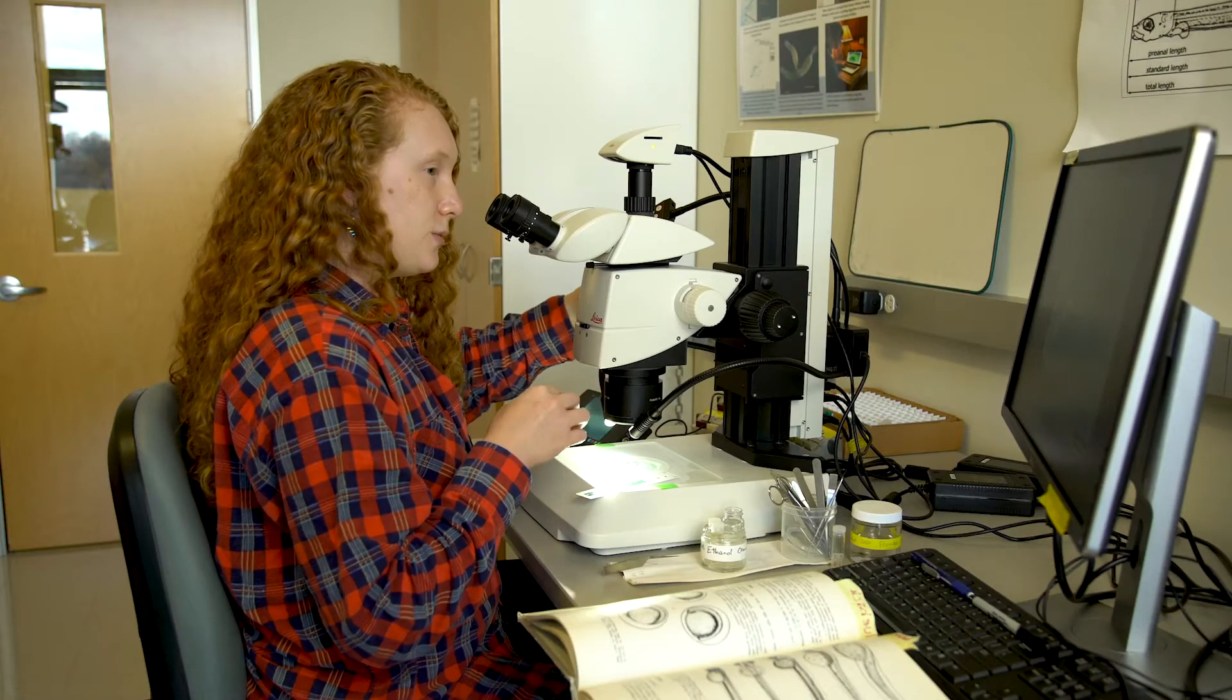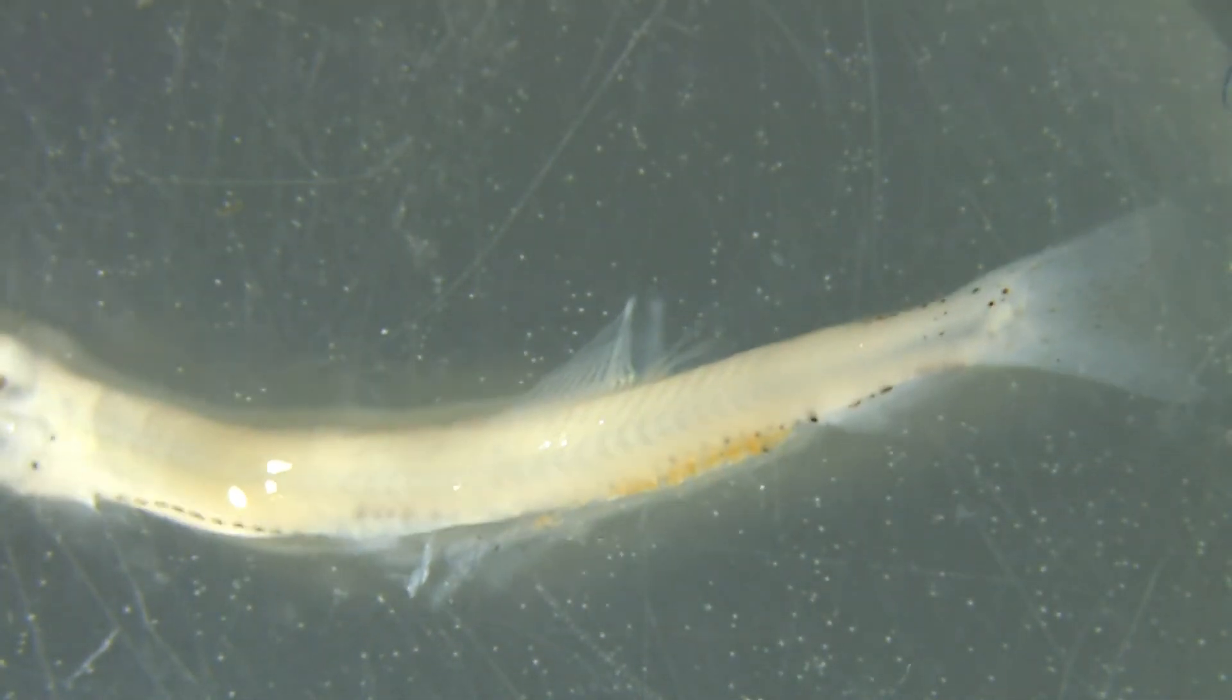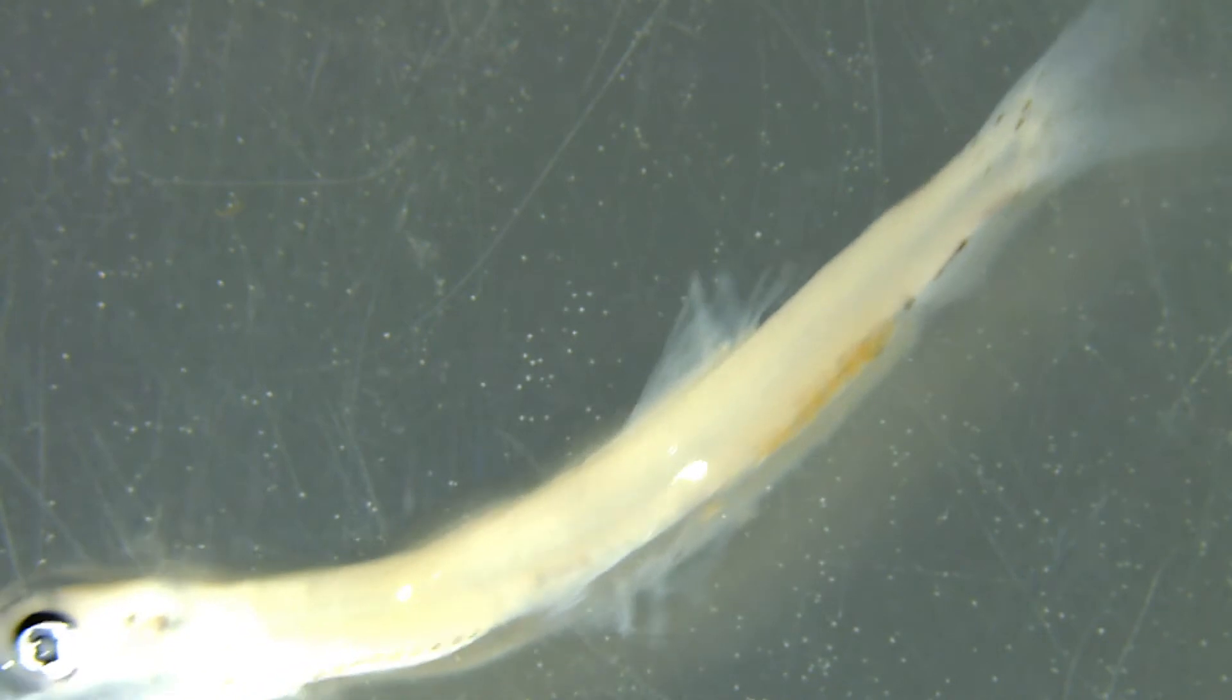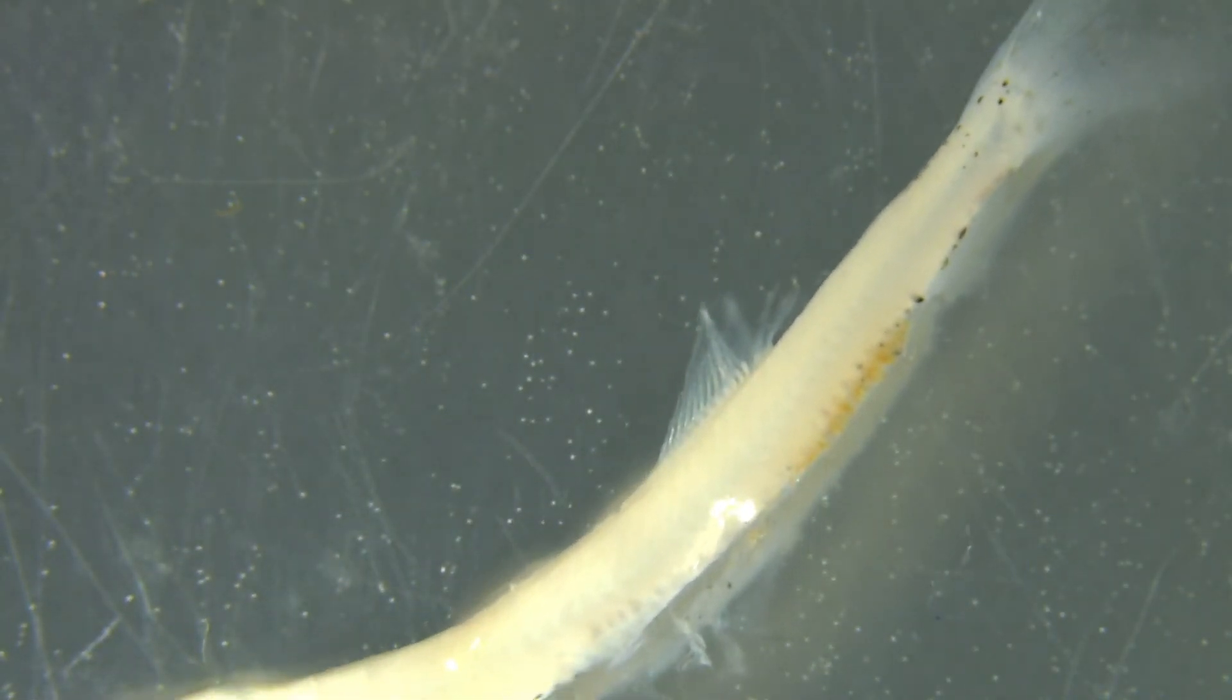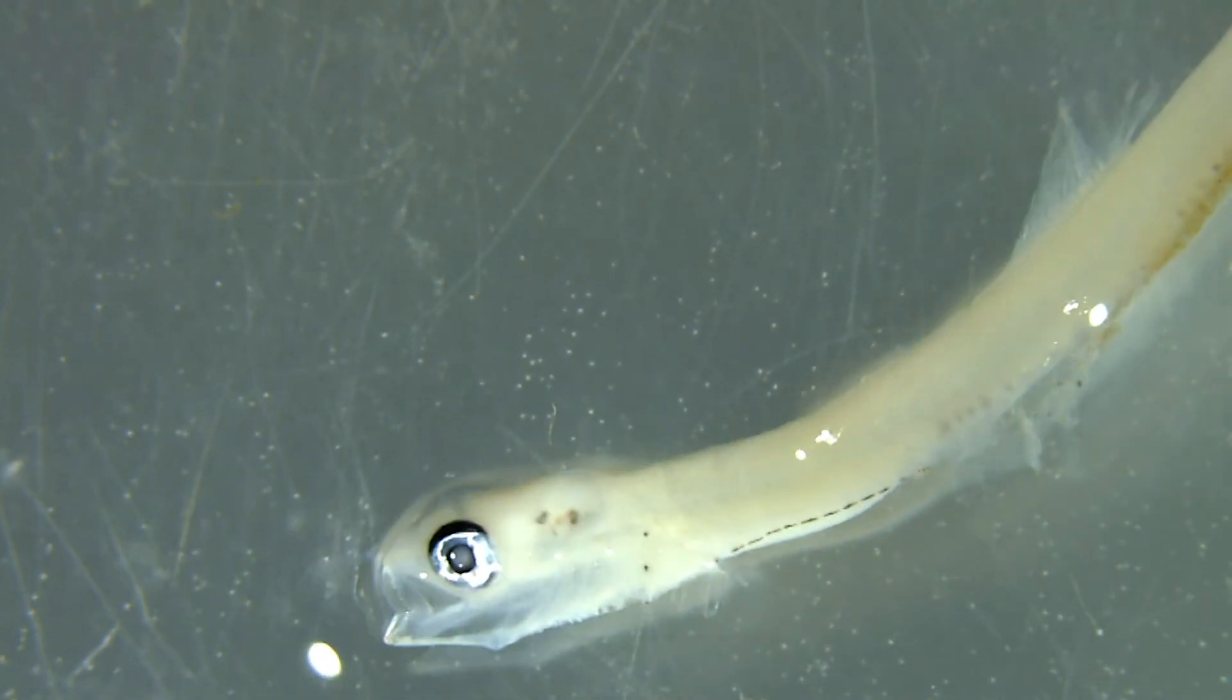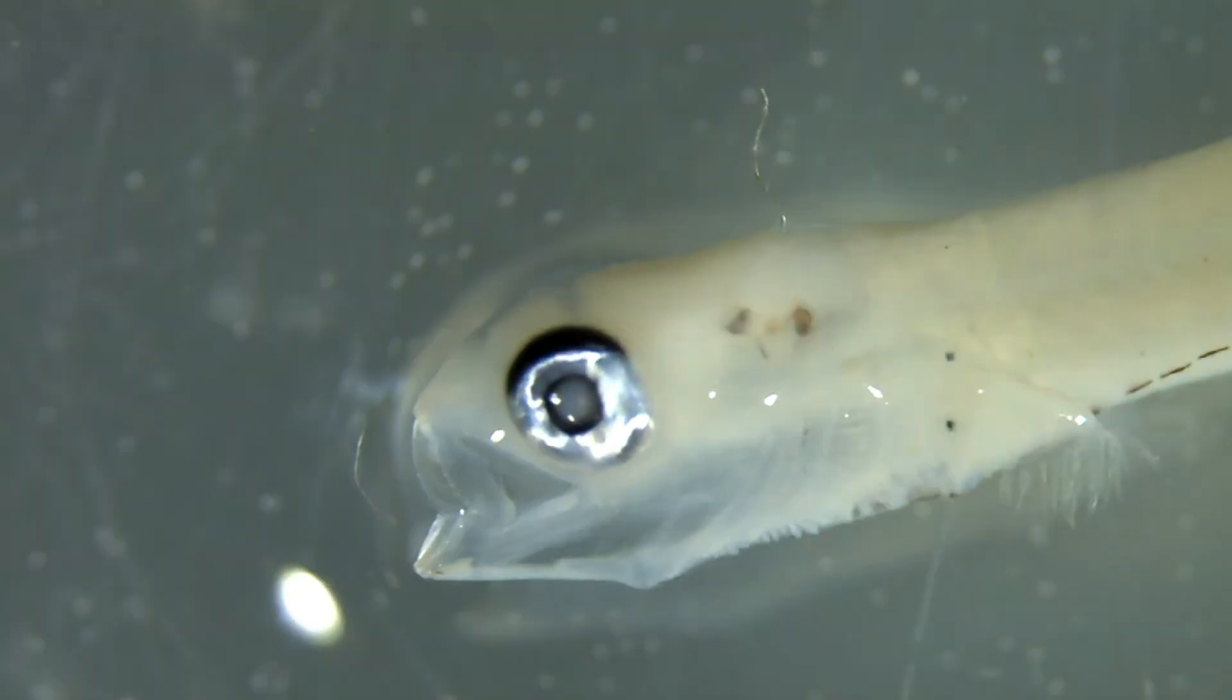By comparison, we have this guy who's about seven days old. He's a completely different fish. He's not a white perch. But as you can see, he's so big he barely even fits under the microscope. He doesn't have a yolk sac. He has his mouth and he's big enough to eat on his own. He'll eat plankton, anything that'll fit in his mouth that's nutritious.